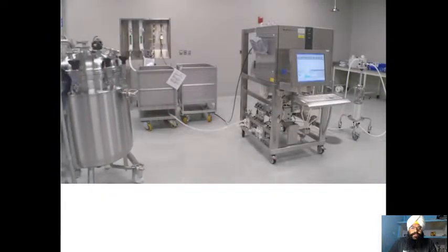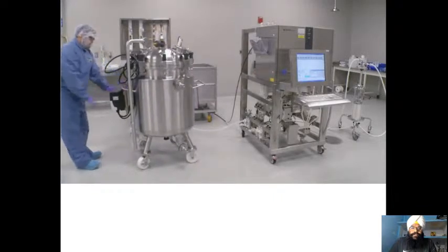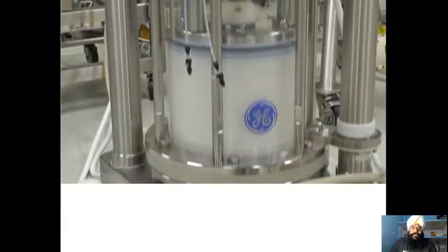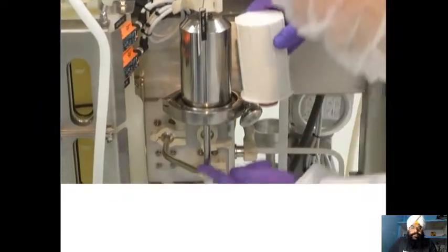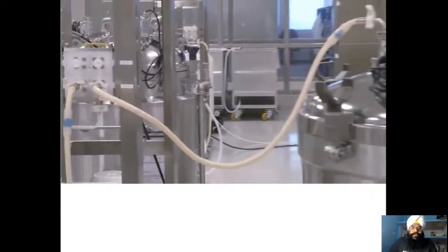In our process, which uses ion exchange and hydrophobic interaction chromatography, the chromatography equipment is housed on a skid to make it compact and mobile. The main part of the apparatus is a glass column filled with resin beads, but we also have pumps to move the clarified lysate through the process, a supply hose and port to feed the column, a pre-filter to remove any remaining particulates, usually solid cell debris that has not previously been removed, before the clarified lysate enters the column, an exit port for the processed solution, and auto switching valves for directing processed solution to either waste or collection.